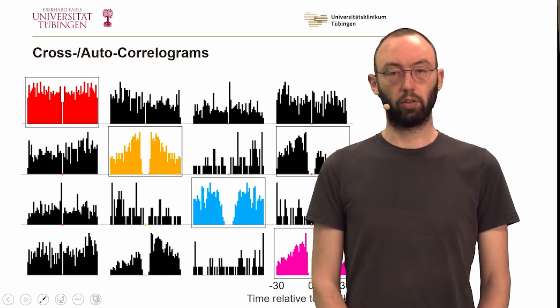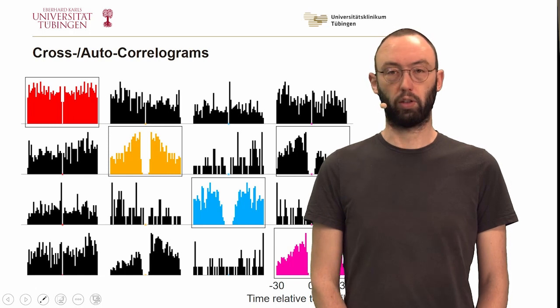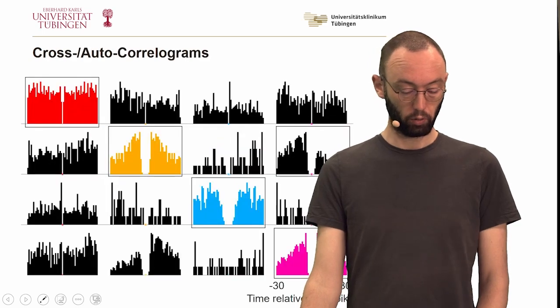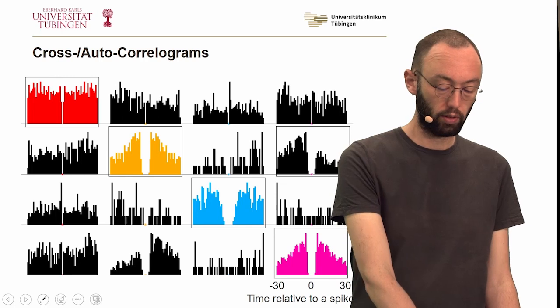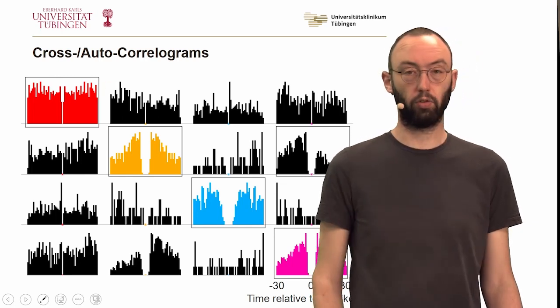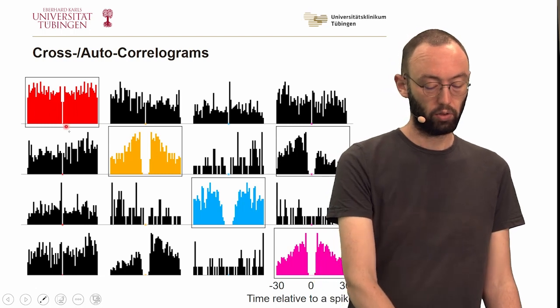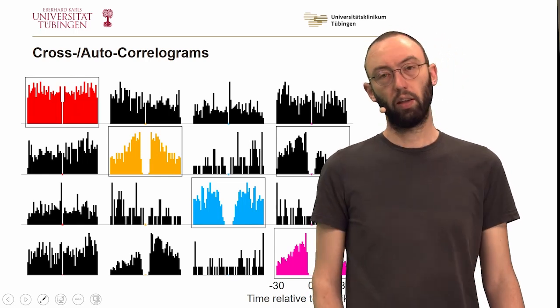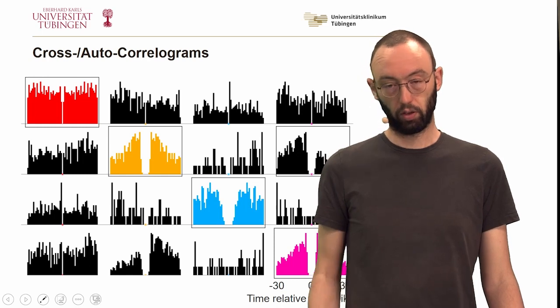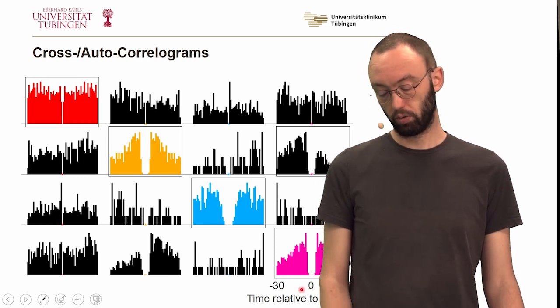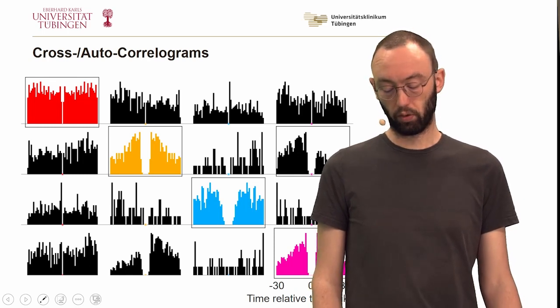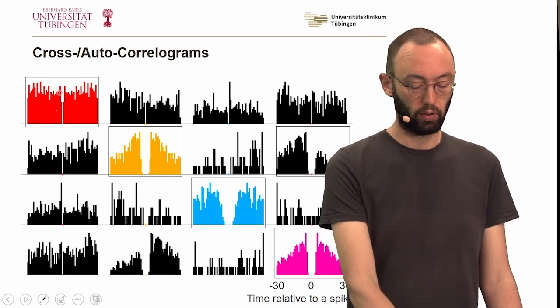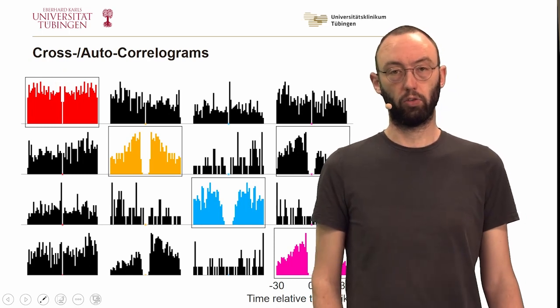Let's look at the cross- and auto-correlograms of our clusters, or at least of a subset of the clusters. What are features that are important to note here? First, this red cluster. The red cluster has an auto-correlogram which is relatively flat and also doesn't show a proper pause in the middle. A pause here in the middle would be a signature that the refractory period is observed. Note the time scale - this is now zoomed in from minus 30 to 30 milliseconds. So a refractory period should be at least on the order of plus minus a couple of milliseconds. But there is nothing to indicate that this red cluster here has such a refractory period.